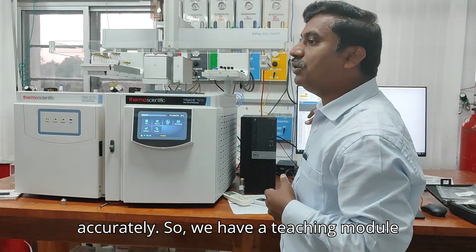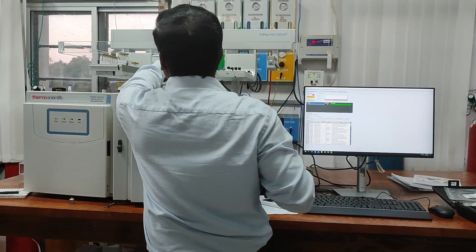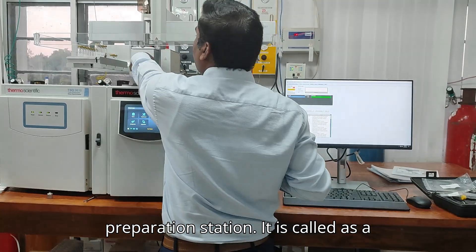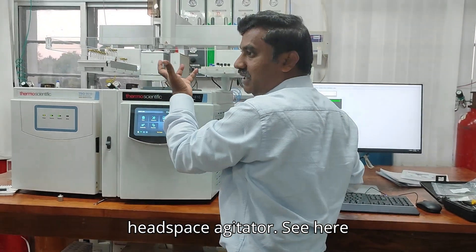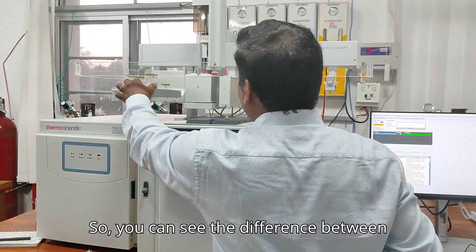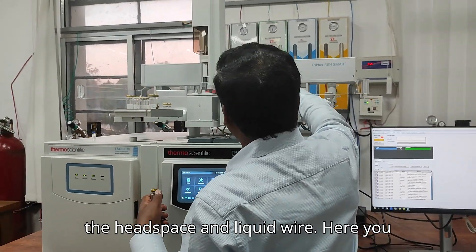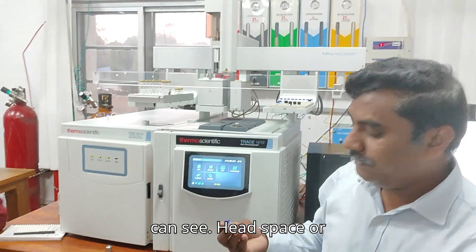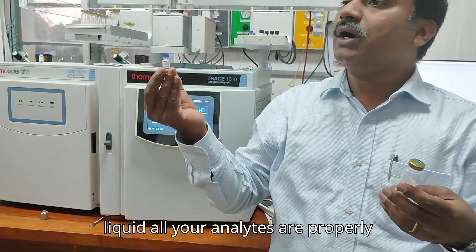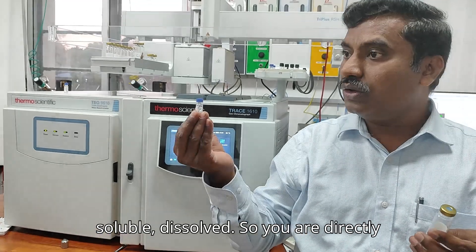We have a teaching module for positioning. Next, there is a sample preparation station called an agitator — this is a headspace station. You can see the difference between a headspace vial and a liquid vial. In the liquid injection mode, all your analytes are properly dissolved, and you are directly injecting one microliter of the solution into the GC system.